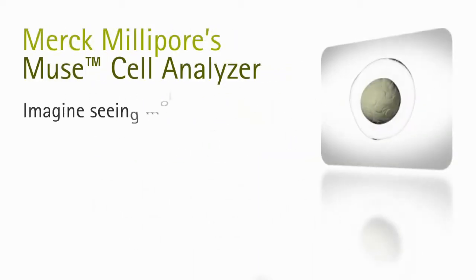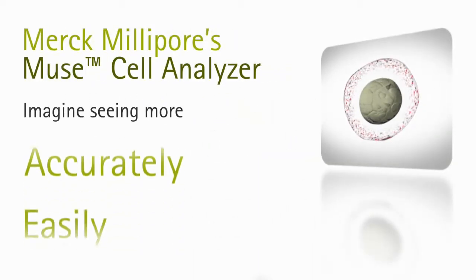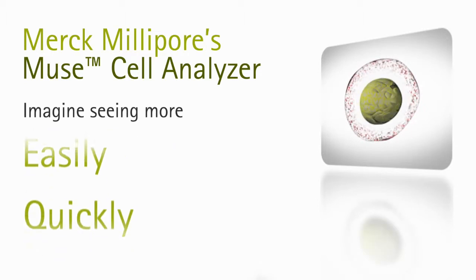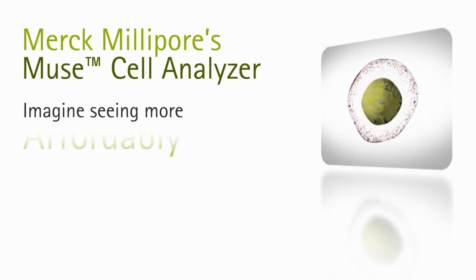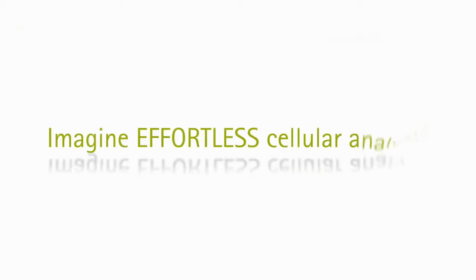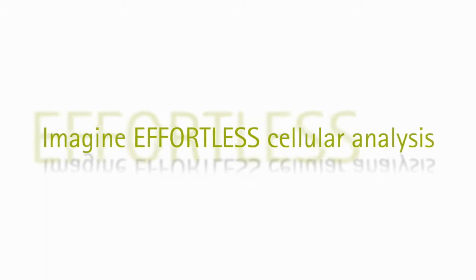Imagine seeing more—accurately, easily, quickly, and affordably. Imagine effortless cellular analysis.